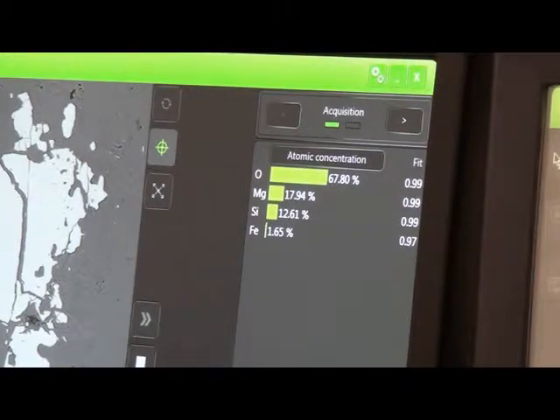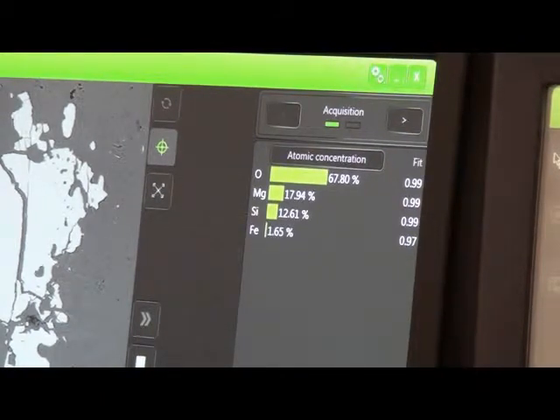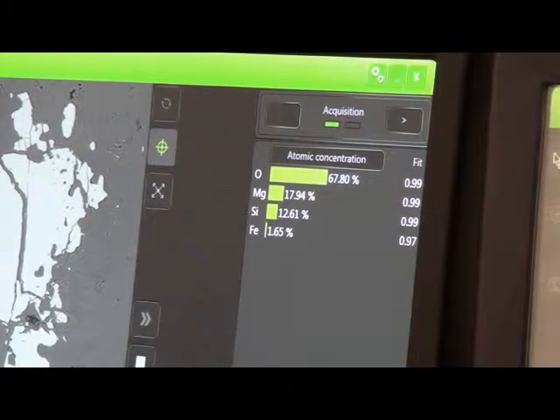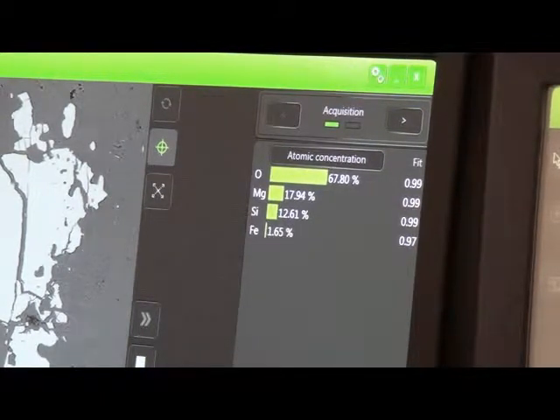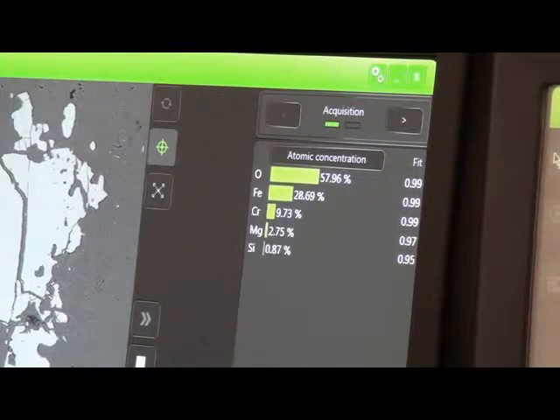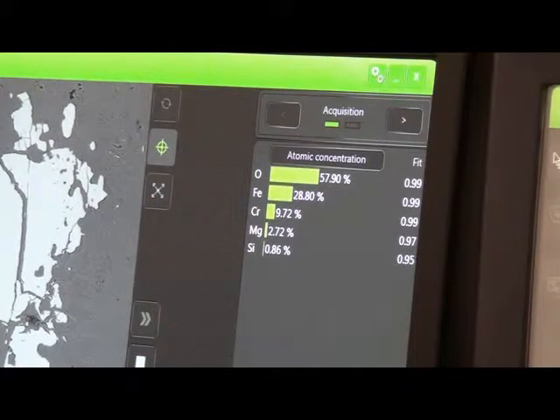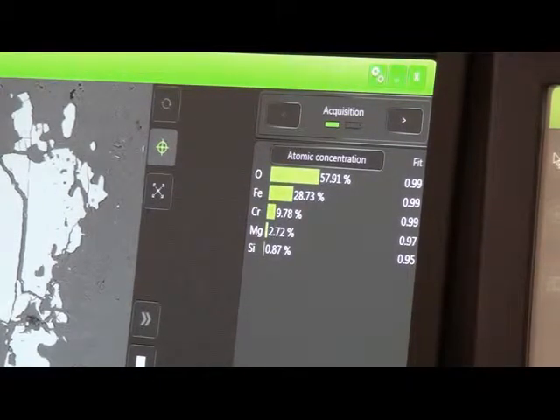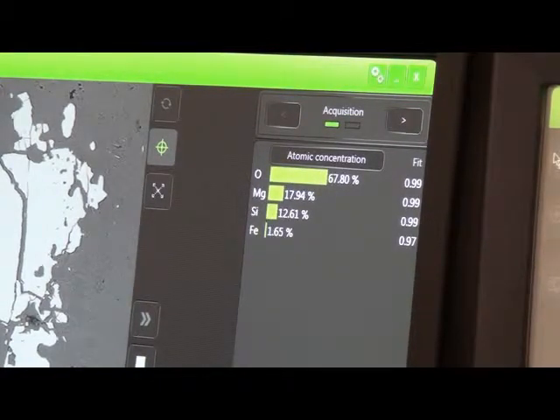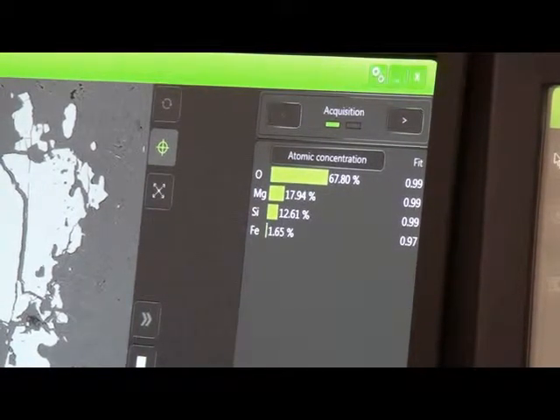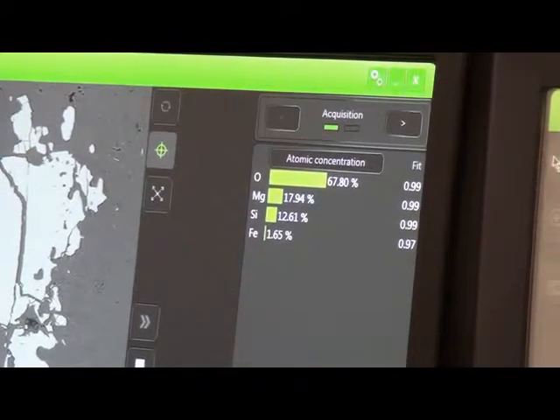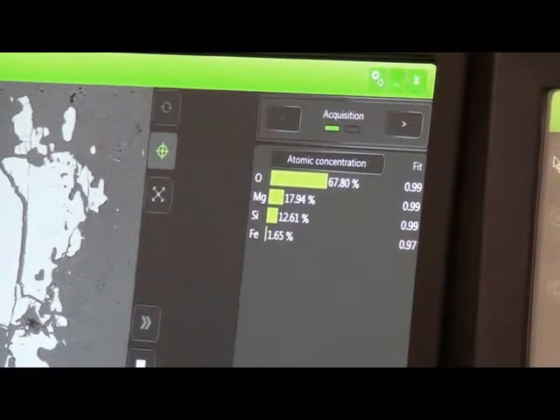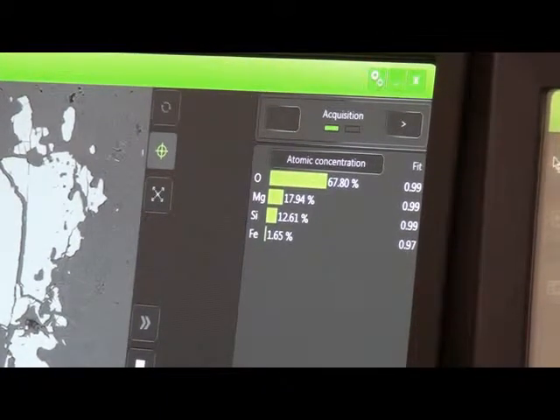There's a lot of oxygen in this one. And in the second one, I think there's more iron. We have iron here. Right. That's a very iron-rich phase. That's actually an iron oxide phase.